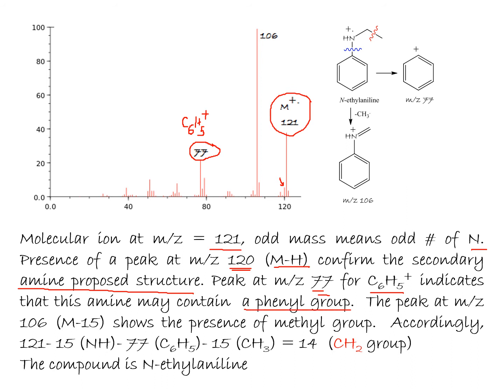The peak at 106, the base peak, M minus 15, shows the presence of a methyl group.